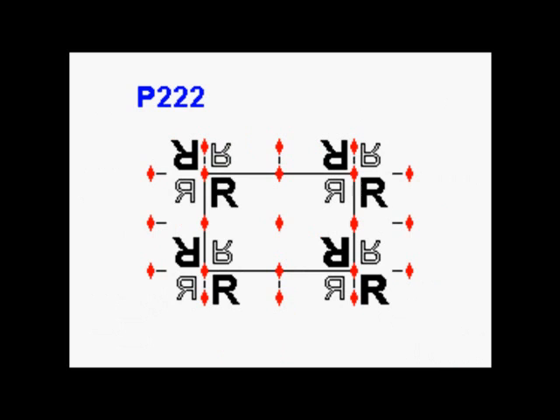On this slide we've got a view of P222 from one side. The lines again represent planes of rotational symmetry. The R's represent proteins, and those dots simply represent the places where these planes intersect. At each dot, try to imagine another line also intersecting that's going into the page. The bigger, darker R's represent proteins that are slightly closer to you from the side you're looking at it, and the smaller see-through ones represent proteins that are slightly further away.